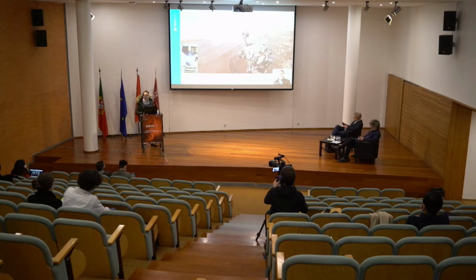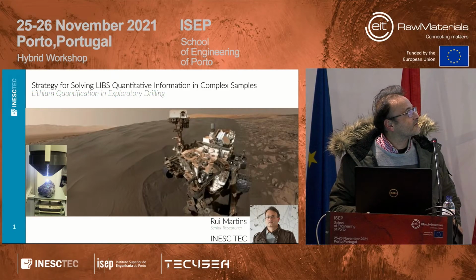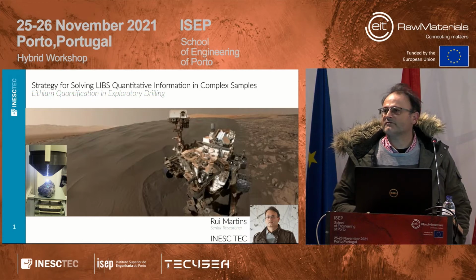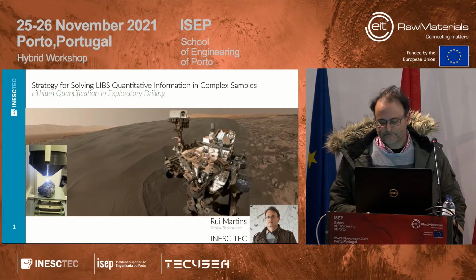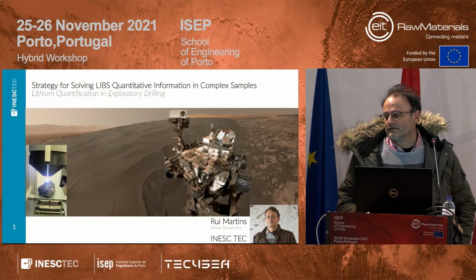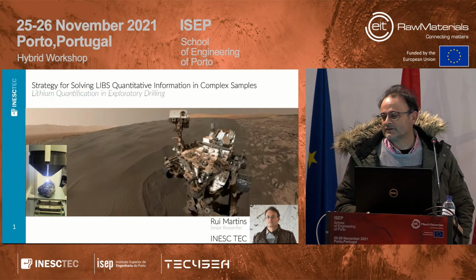I'm very thankful to be here to present something that is perhaps different from the other speakers, because I am giving a talk about the information contained in LIBS. LIBS is an information-rich technology that is not fully understood, both theoretically and in the aspects of extracting accurate information that allows the quantification or classification of minerals and elements.